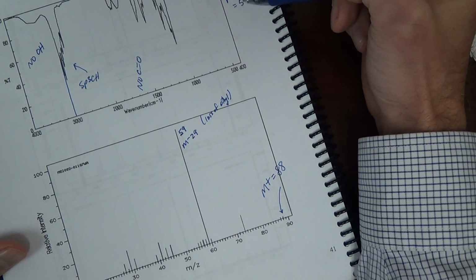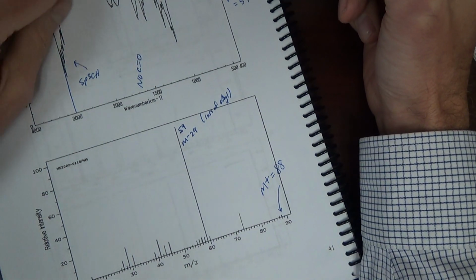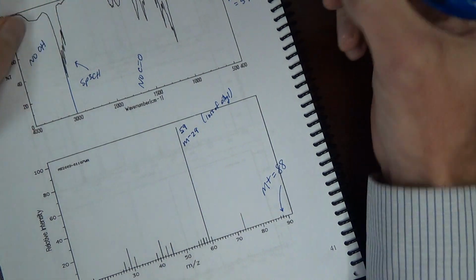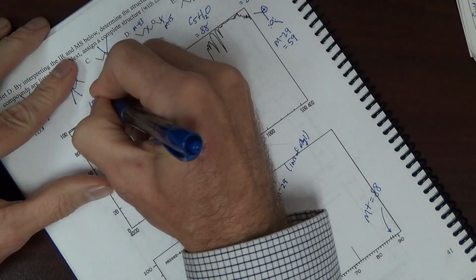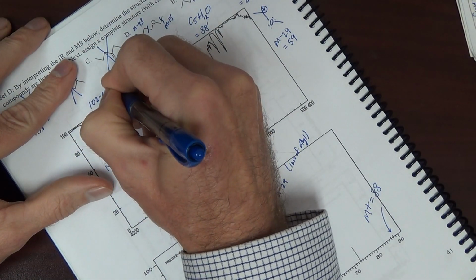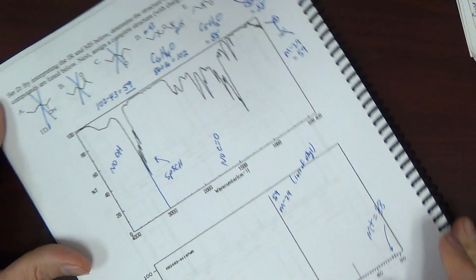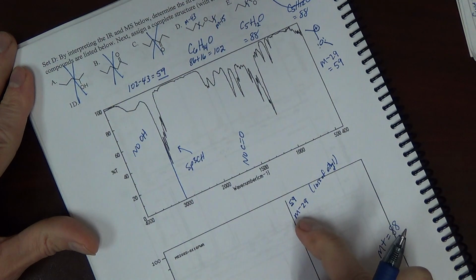Where this one I expect to lose 29. Interesting though, if this is 43, that would be 102 minus 43 equals 59. We have a peak at 59.